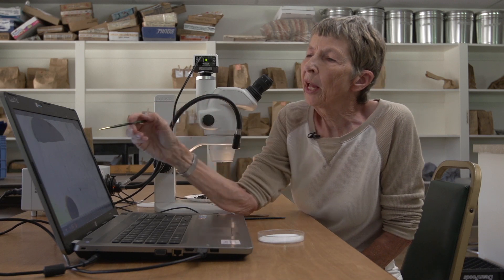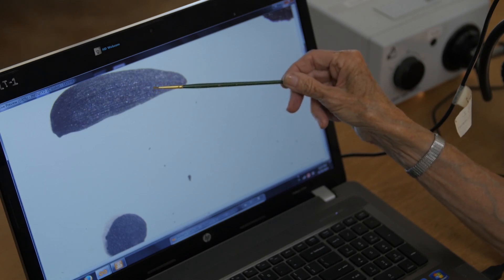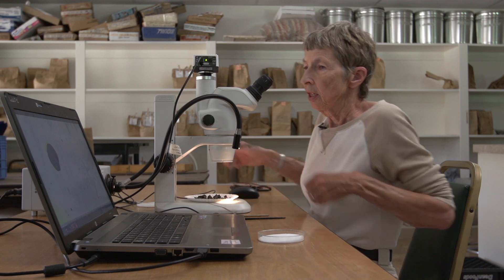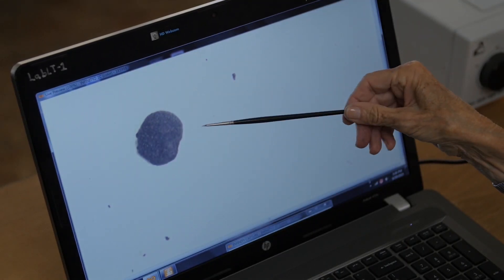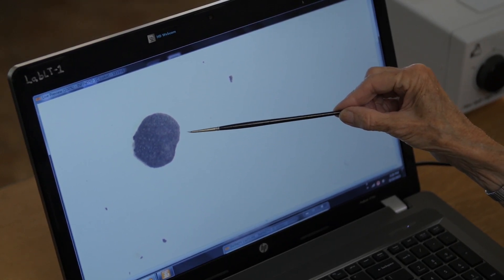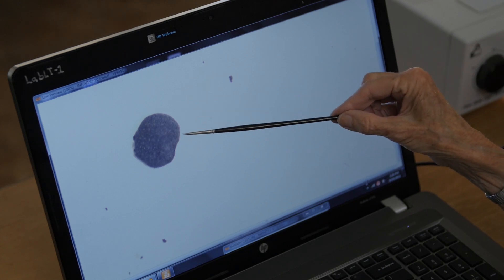One more interesting fall plant — this is a piece of a sunflower seed. It's actually the striped part on the outside that you take off to get to the seed on the inside. That's a fall available resource. And this last little seed is a ground cherry or husk tomato seed — it's inside of a little tomato-like fruit, what we call wild tomatillos. This is also a late summer, fall ripening resource.